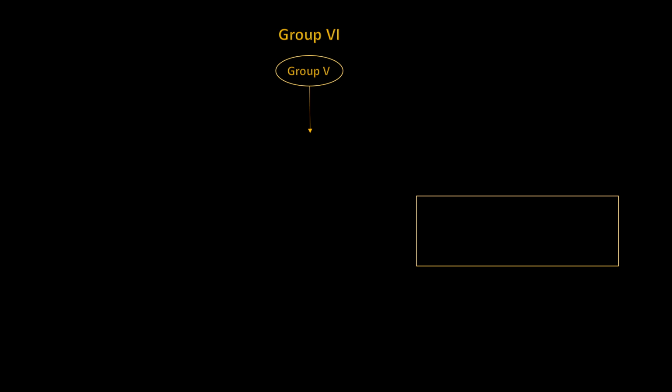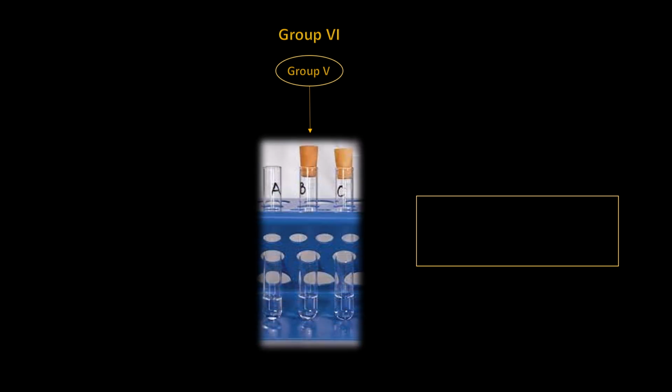The test tube containing the filtrate from the Group 5 separation, just cap it and label as Group 6 elements and set it aside with the others. The Group 6 elements will be further treated during the elemental separation from the groups as they are ions in solution. No precipitates, or there shouldn't be. In addition to, the Group 2 elements will be further separated prior to the elemental separation process. All will be shown in Part 4 of this series.